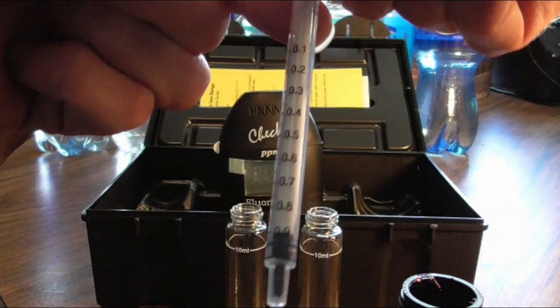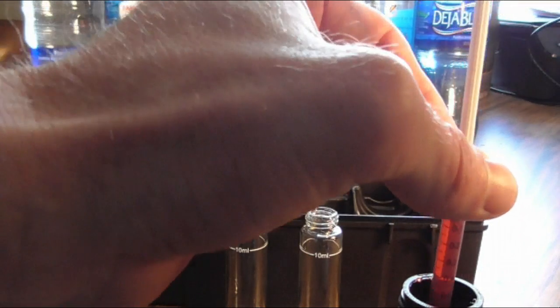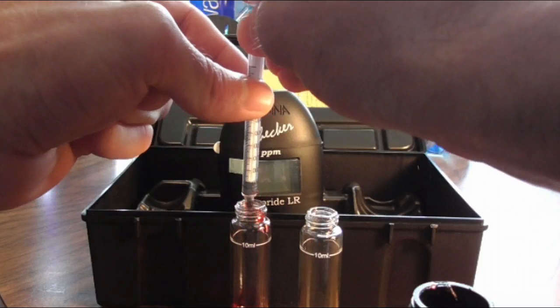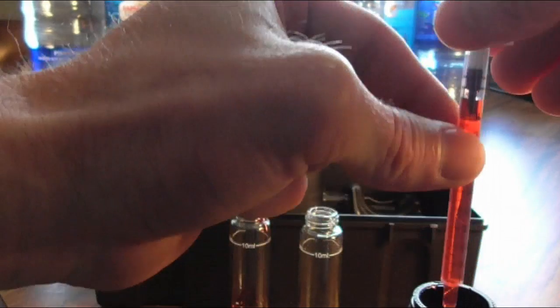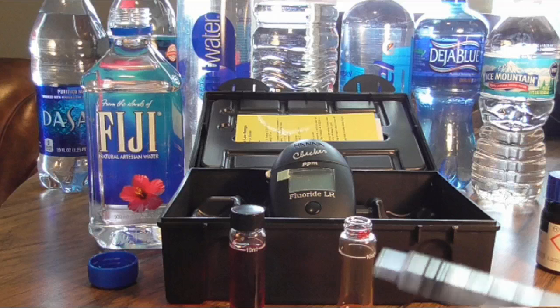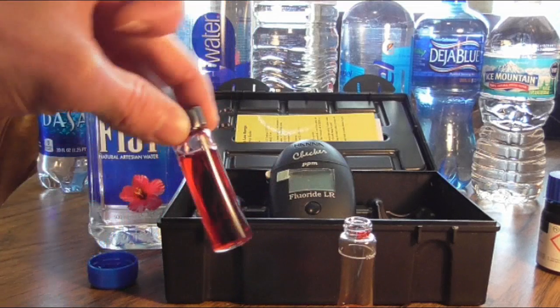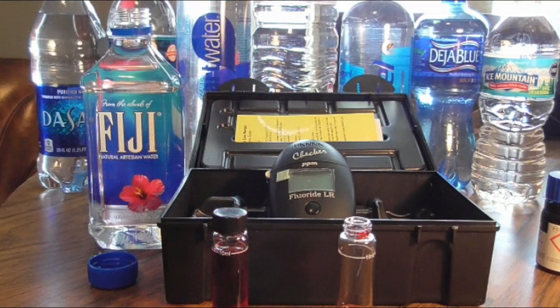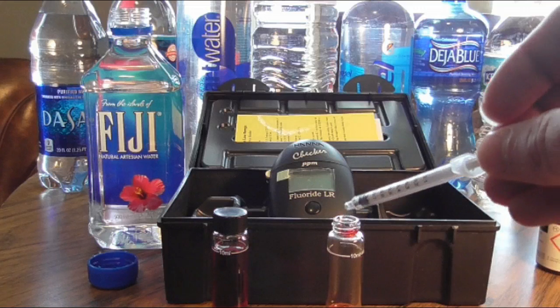Now you can see that this is one milliliter when completely full. What we're going to do is take and put our two milliliters into each one. Just make sure you hit your 10 milliliter line there. Once you have your distilled water in, don't shake it up too much — you don't want a lot of bubbles — and make sure your vials are wiped clean. Then I'll move on and I'm going to test Fiji here first, filling it up to the line.